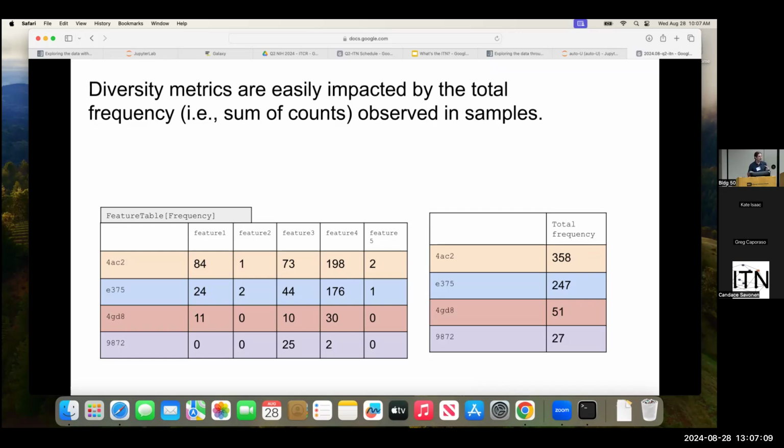In a sequencing study, the corollary to that is how many sequences we collect from an environment. To this date, we don't really think that there's anything biologically relevant driving these differences in the sequences that we collect. There may be some extreme examples, like a truly sterile site or sample, where you may observe fewer sequences.